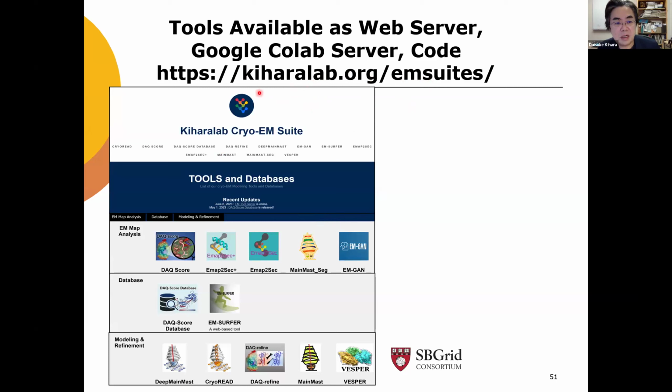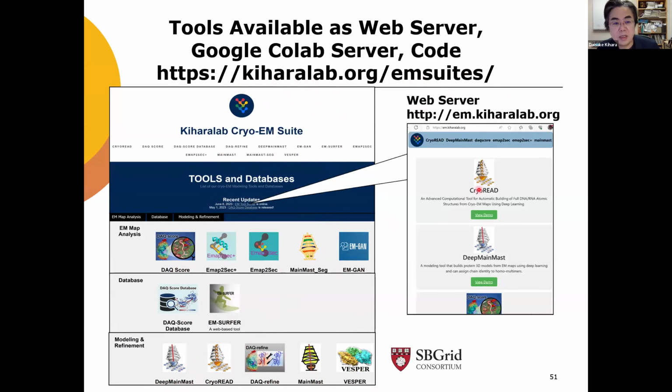Please search probably my name and also CryoEM, and then you will find this website, EM Suite. EM Suite includes many tools for map structure analysis, and also the DAQ database and the modeling tools, including DeepMainMast, CryoREAD, and DAQ-Refine. And for major tools, we also have a web server.